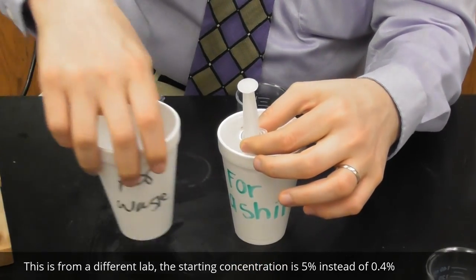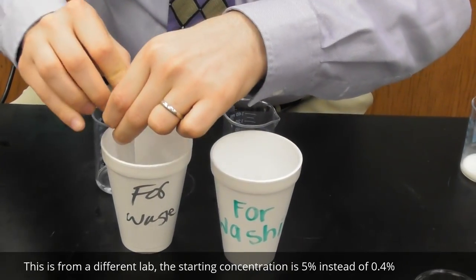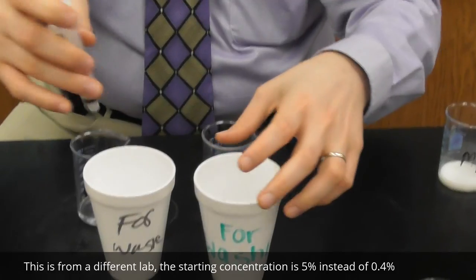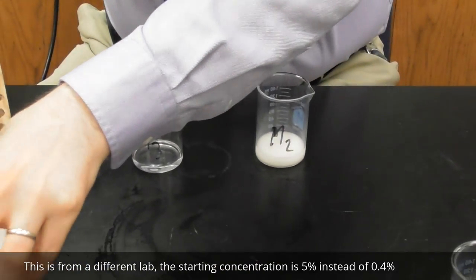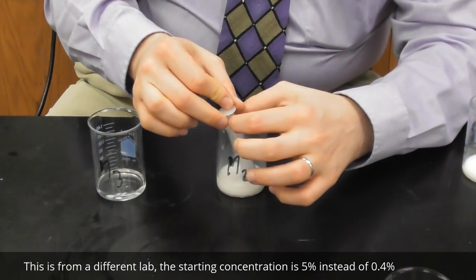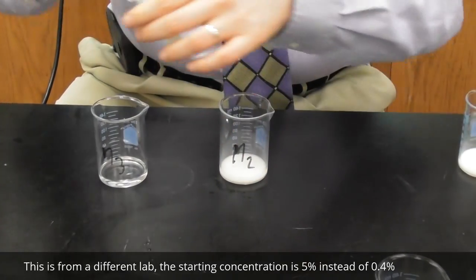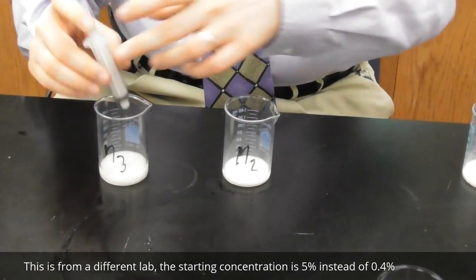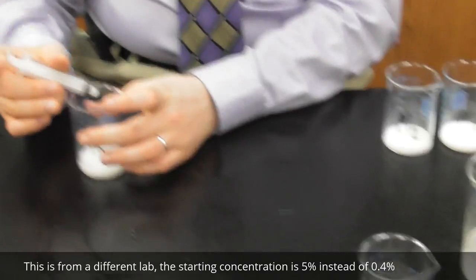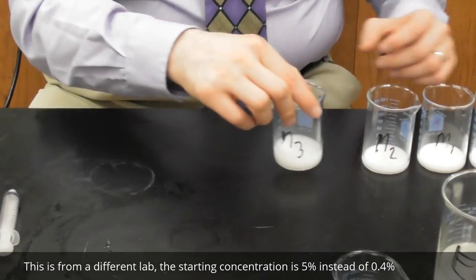Washing, for waste. For washing. For waste. Set those aside. Now, take out 10. Put 10 in there. Set that aside so I don't screw up again. Set that down. Swirl that. And I'm done.